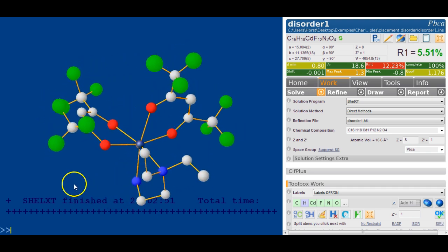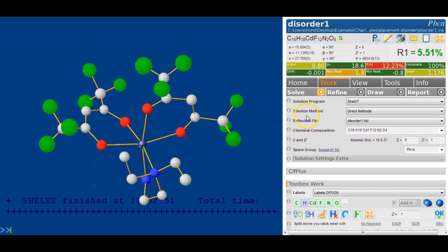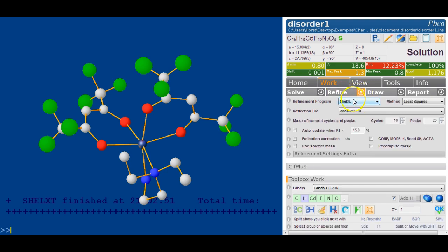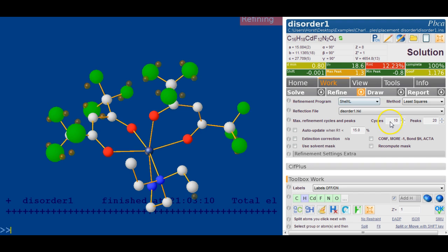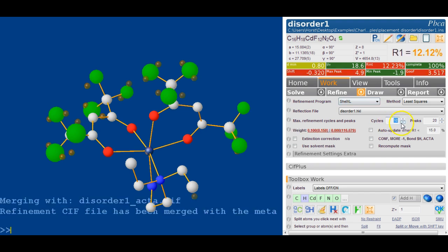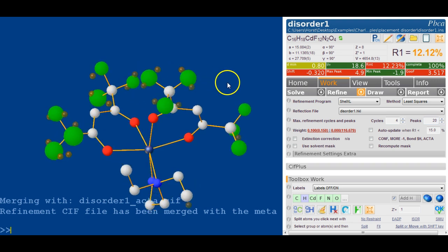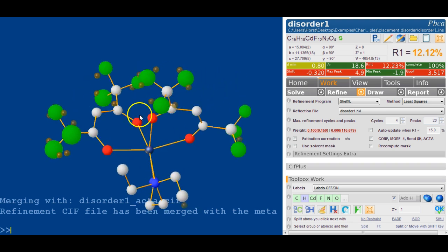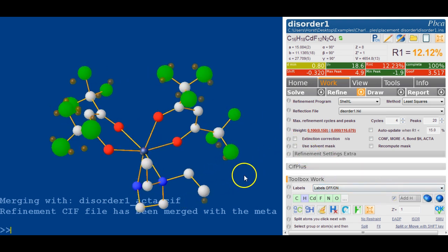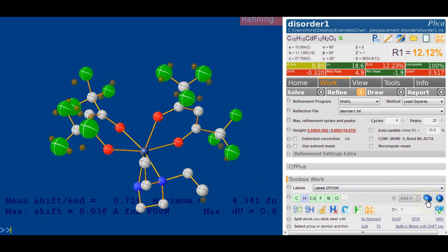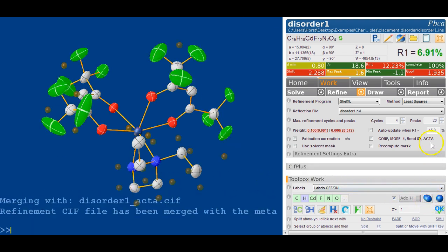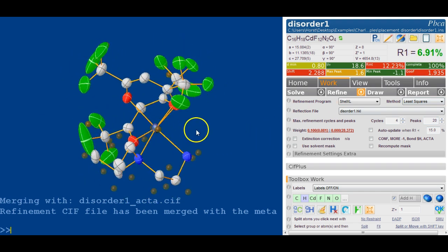So what we need to do is refine this structure. We've got Shell XL on - let's run about four cycles. All the spheres are about the same size; the fluorines are bigger because they are rotating, and this is the purpose of this tutorial. We click on the ellipsoid button to make them anisotropic. The R factor is now close to 7%. That looks good, and we can already see the hydrogens.